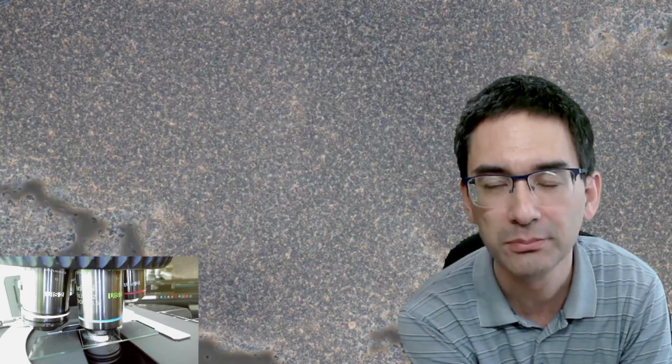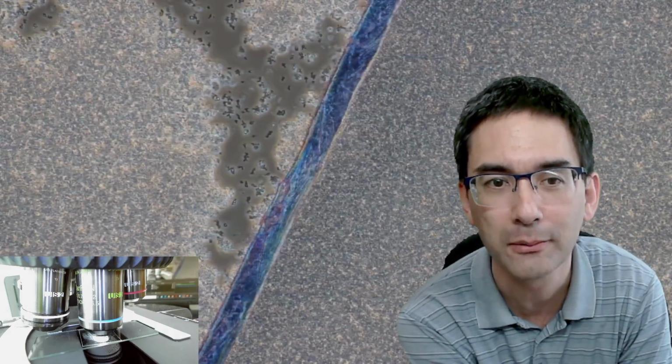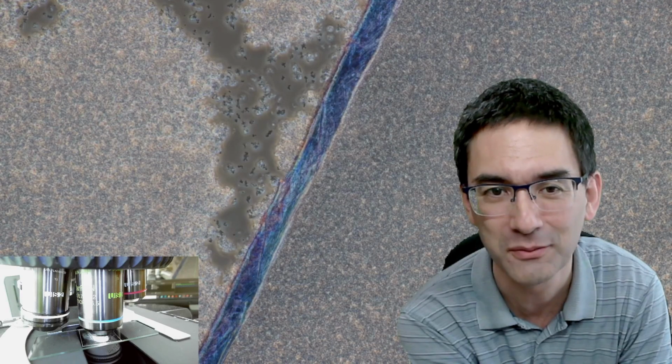So, and yeah, we have to now try to focus everything correctly. And then if we're lucky, we're going to find some bacteria. And all of those dots that you see, yeah, maybe there are bacteria in there as well. Look at this blue gigantic fiber. It's just some dust that was on the microscope slide.